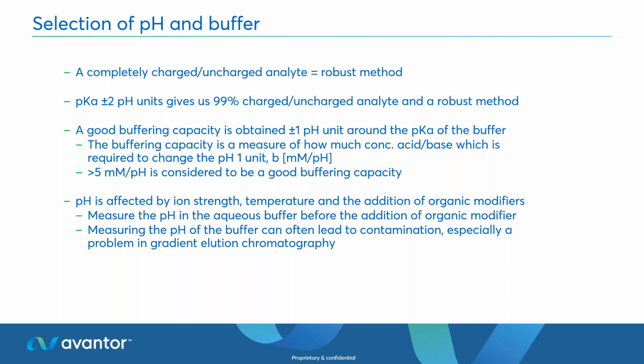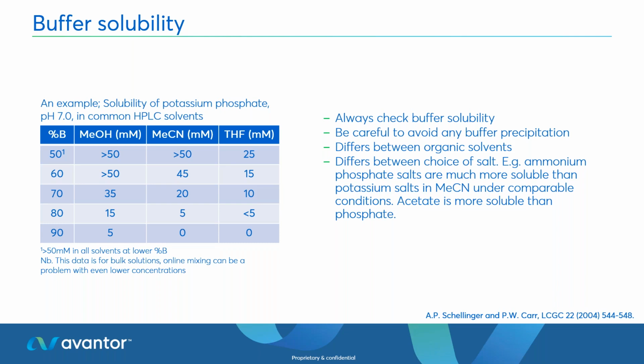Also be aware of the solubility of buffers. They're going to be different in different organic solvents. So again, I've got my 3 favourite solvents here, acetonitrile, methanol and THF, and you will get different solubilities of different buffer salts in each of these. So make sure you're not getting any precipitation, especially when you're online mixing, because that can be a major problem.